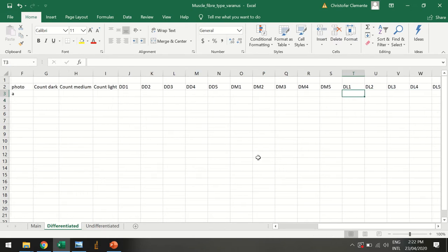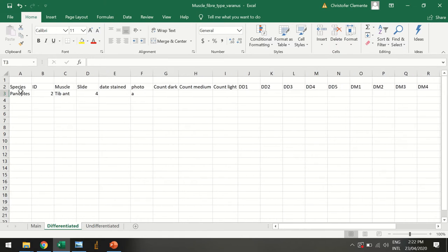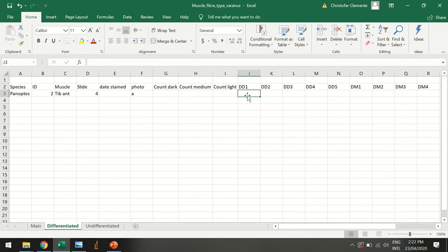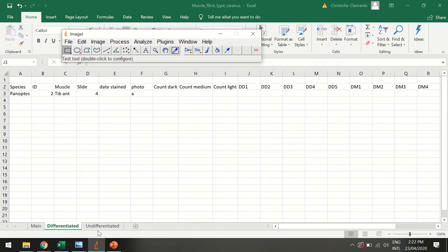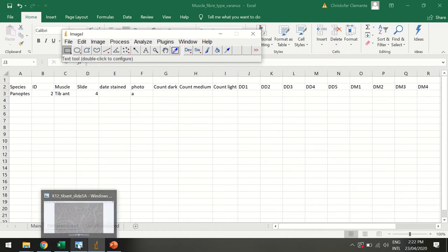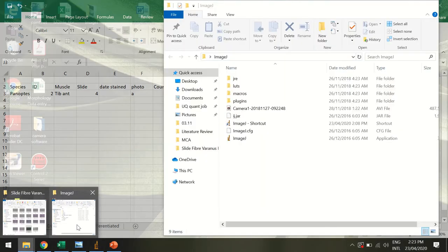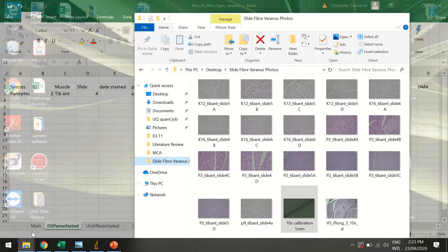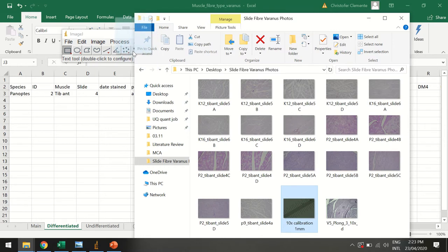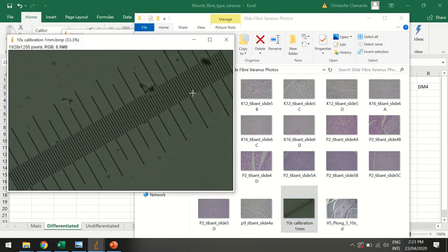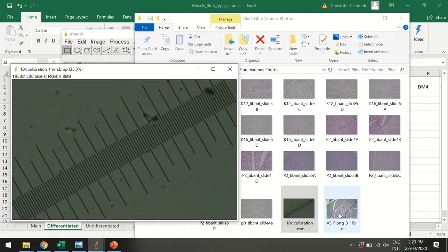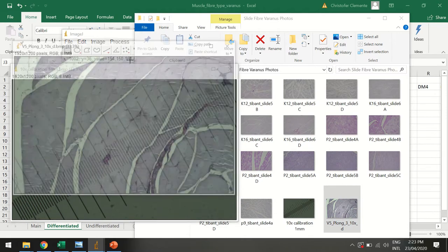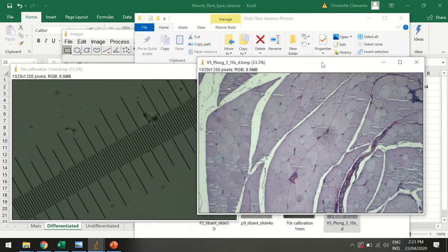So how do we get these diameters? Remember we've put in our species, our ID, the muscle, the slide. We've already counted these and now we want to get to our diameters. We're going to open up ImageJ. ImageJ, remember, it's downloadable and I want to open up my files in ImageJ. The first one I'm going to open up is this calibration file, so I'm going to drag and drop that. You can see there's my calibration file, and then I'm going to open up the file of interest.